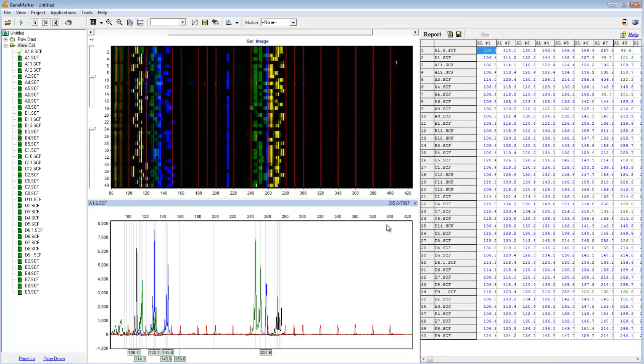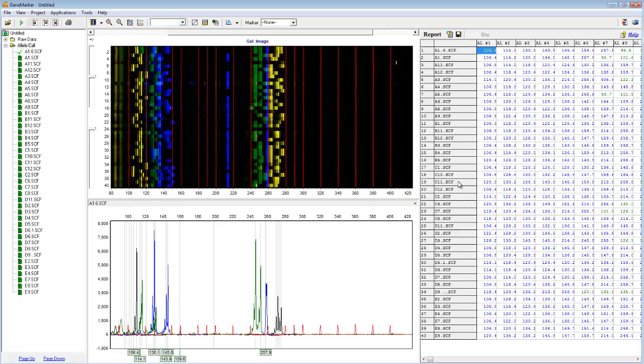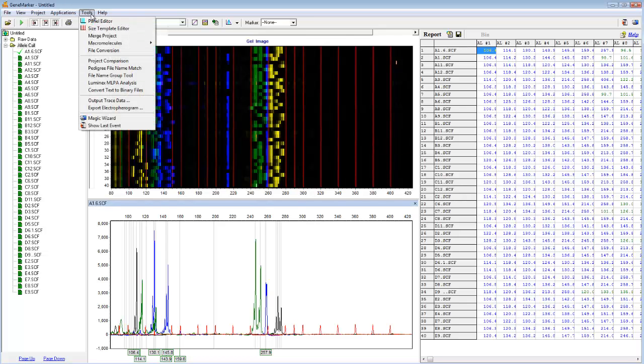We can see from the green icons on the left that size calling was successful. However, as we might expect, there is no allele call information because we didn't upload a panel. To begin the process of creating our panel, go to the Panel Editor, which is under Tools, Panel Editor.